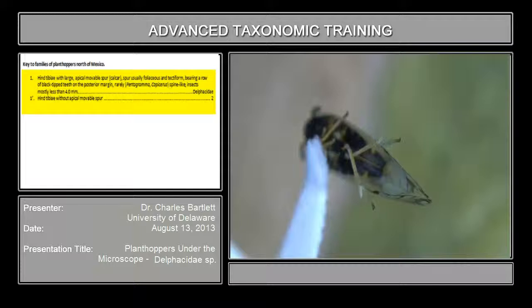Rarely, in a couple of genera, it is spine-like instead. I don't have an example of that, but you're quite unlikely to see that group. And here we go.